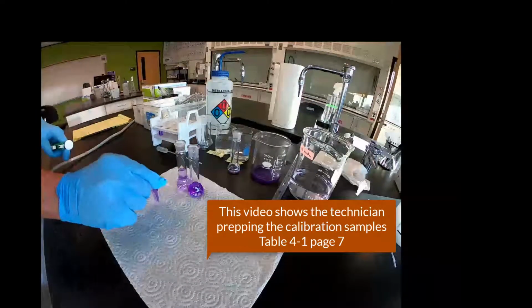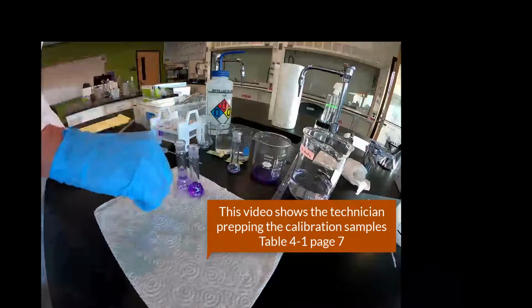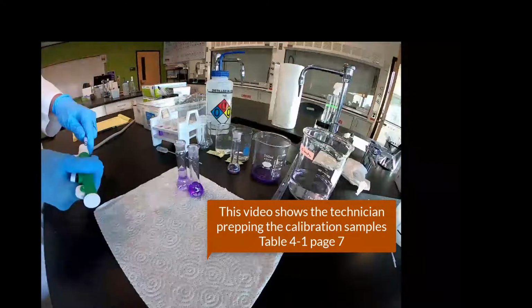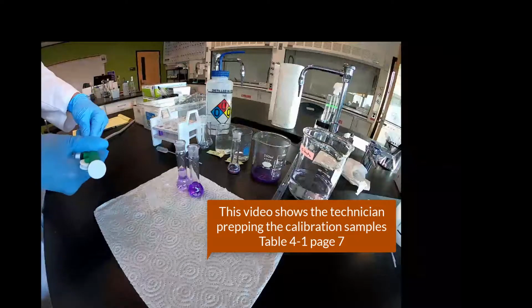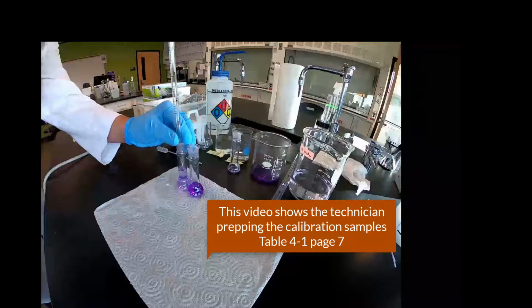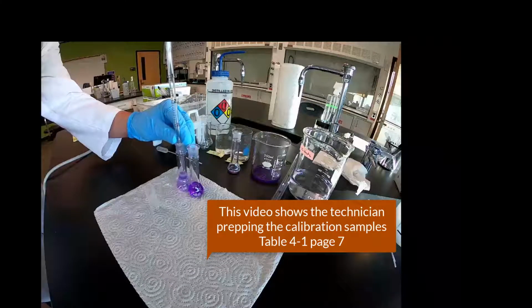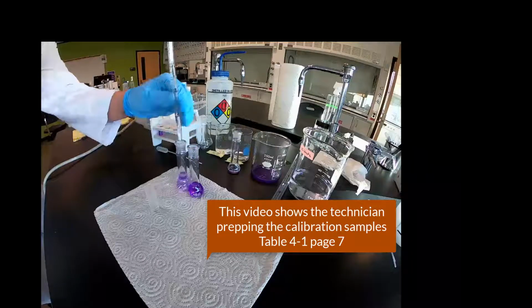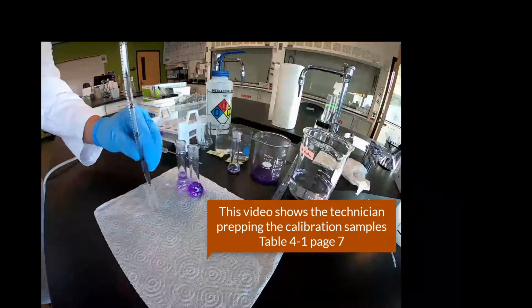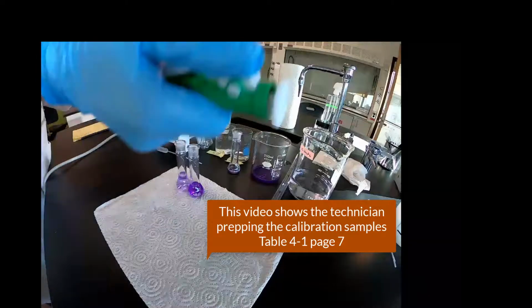So now we're going to put that cuvette in line so we know what's what. You can even mark on the top of those if you need to. Now we're getting our 3rd cuvette. And again, throwaway pipettes would be better here because instead we're burning up these volumetrics. No need for that. But this is still very good technique for the very first time ever attempted. I'm pretty impressed here. So we're going to put a little bit in there. You just went right to the mark.